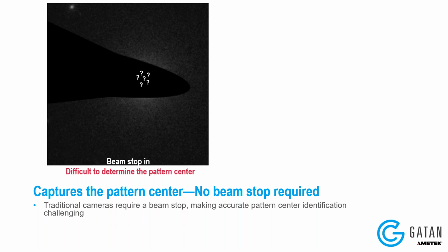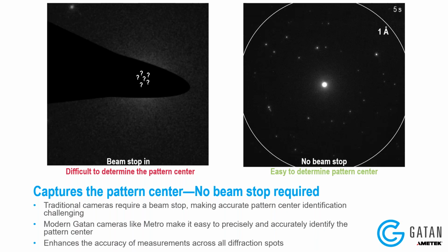you could probably get close just by eyeballing this, or perhaps you could have some very sophisticated algorithm that would somehow determine the pattern center with accuracy. But it's non-trivial, right? To determine exactly where is the pattern center, what pixel is the center of this diffraction pattern.